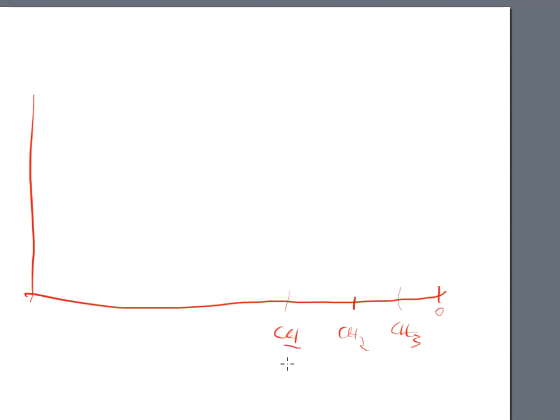So this particular hydrogen is the most positive, and that magnetic field will grab on to that hydrogen, and it will take a little bit more energy to get that thing to flip upside down and scream the signal out in the end. And this is why CH3s are more upfield than CH2s, and that's why they are more upfield than CH groups. Now, I want you to keep in mind, we are only comparing CHs to each other here.